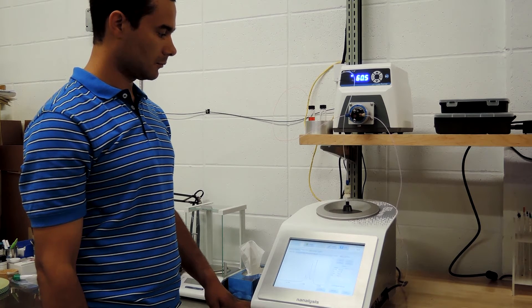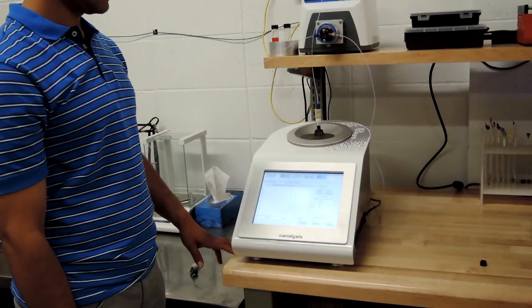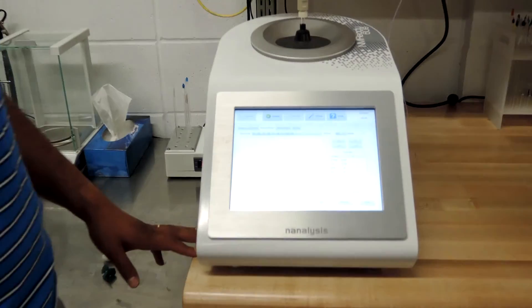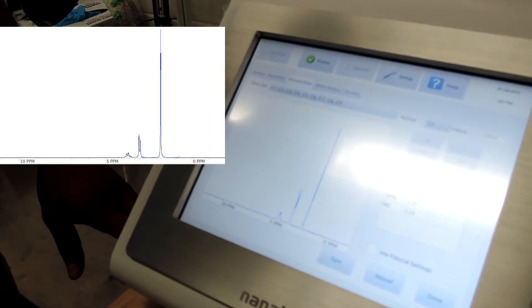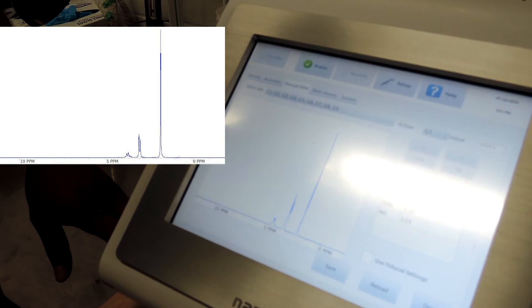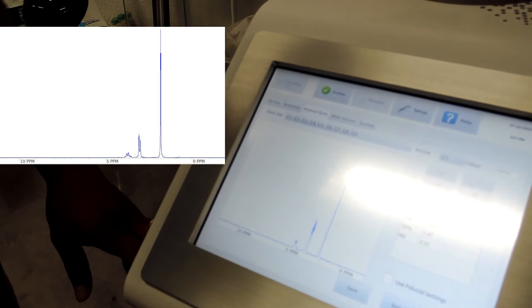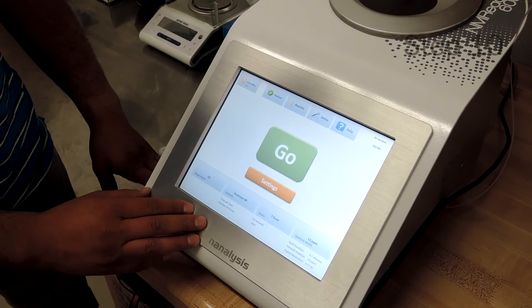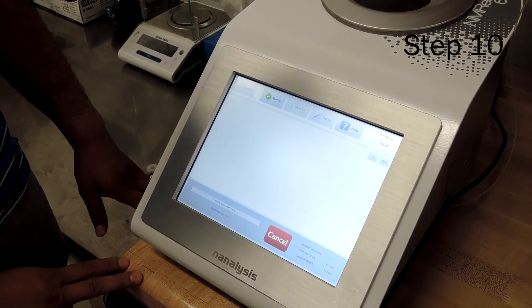As the cell starts to fill, you will see some broadening effects of the acetone-methanol based solution. But as the filling completes and the active volume is uniformly filled with solution, the peaks will become nice and narrow as you would expect. With the setup here it took us about 45 seconds to fill the flow cell, but this can be optimized to reduce lag time and speed up first point measurements. Regardless, once the coil volume is filled you can immediately start acquiring data.